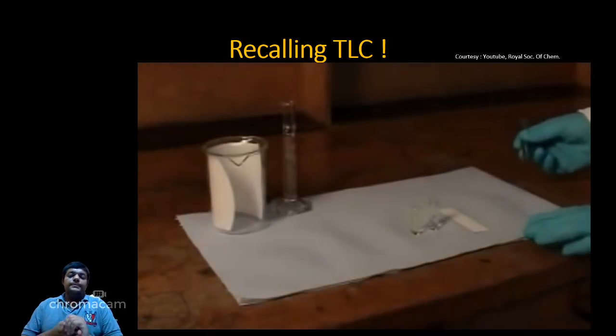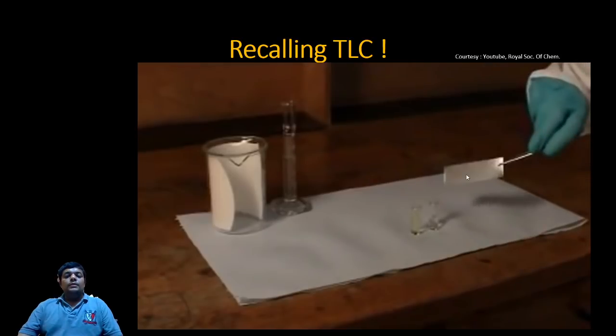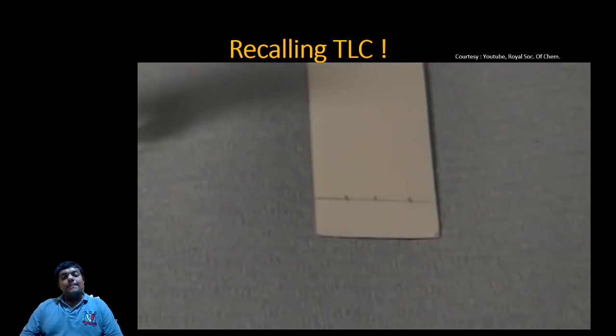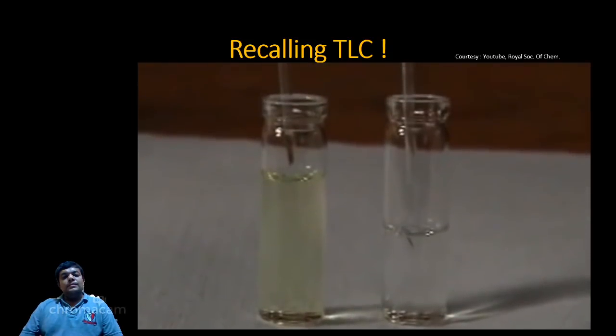To use some silica which has been sprayed onto an aluminium sheet. This is called a TLC. See, this is that aluminium sheet on which silica is being coated, and these types of plates are today sold commercially where the TLC experiments are conducted. plate. We use the properties of the silica and the properties of a solvent to draw the compounds up the plate at differing rates depending on the characteristics of the compound.